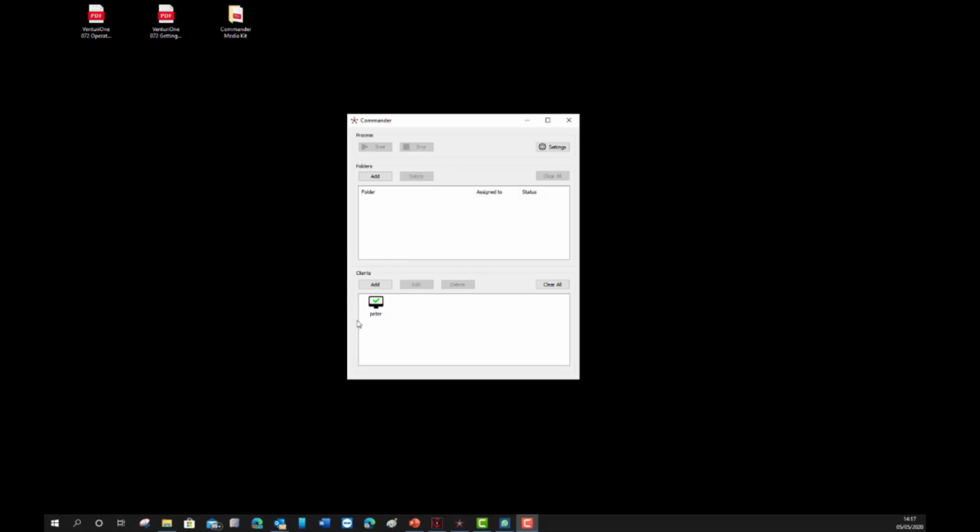To specify a client, click the Add button and enter a name for that client and the IP address for that client. It is better for this solution if the IP address remains static. The client PC must be running Venturi 1 software. If the system can connect to Venturi 1, you will see a green tick. If for any reason the system can't connect to a client, you will see the red spyglass, indicating that it can't see a copy of Venturi 1.